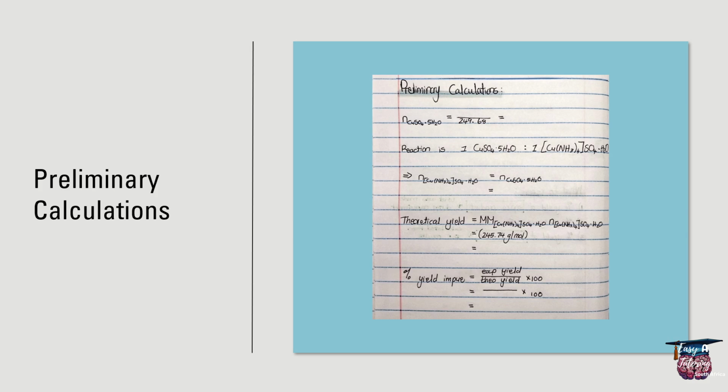And sometimes, for example, if you now have something like your moles, you can see that I have already written in my molar mass here, and this is where it comes in handy to already have your molar mass calculated like I had under my equations.